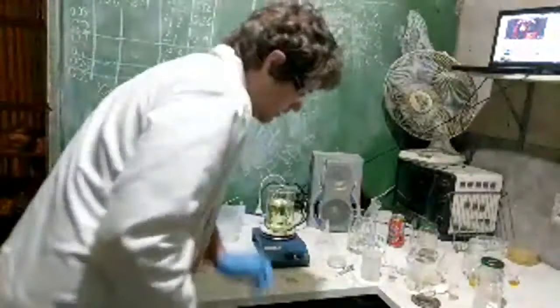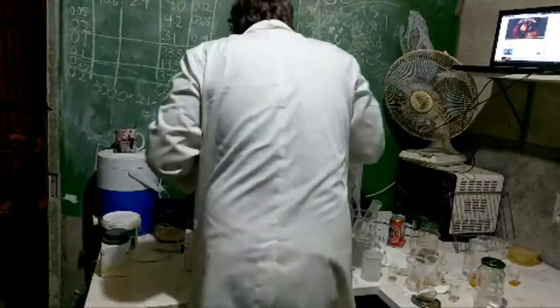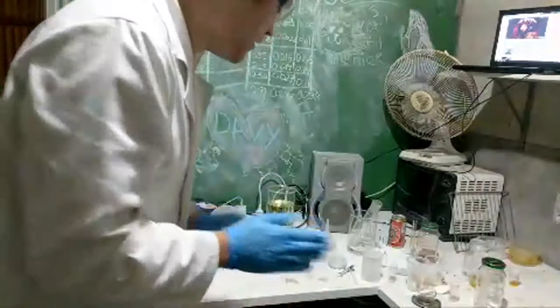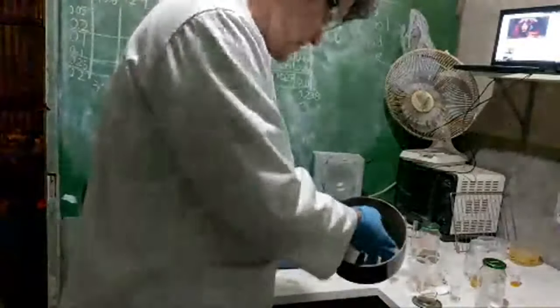Hell yeah. So I've got to turn that on. I'm going to turn this on. No. Not like that. Actually, I should get the iron oxide dissolving in that. No, base. I should get it cooling down. I think I should cool this down. Let's get an ice bath going. I'm jumping all over the place, but I can't even blame it on the stream. This is how I live my normal life.